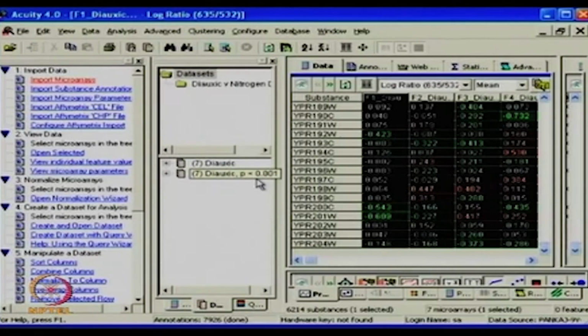Now there are two ways of doing things in the data set. One is to take all the features, and sometimes people say I want to have my criteria defined such that my visualization makes more sense to me. So one can be stringent at this stage itself and say, okay, I want only very biologically significant ones. True. Define the p-values, and then sort data based on that. True. So people can select changes up and down with a range of so and so, twofold upregulated, twofold downregulated. Right.